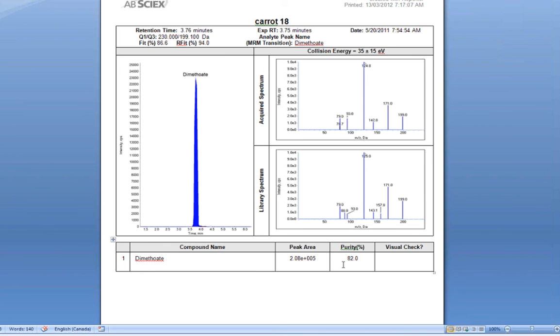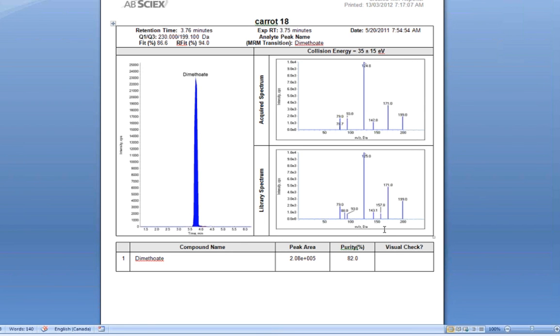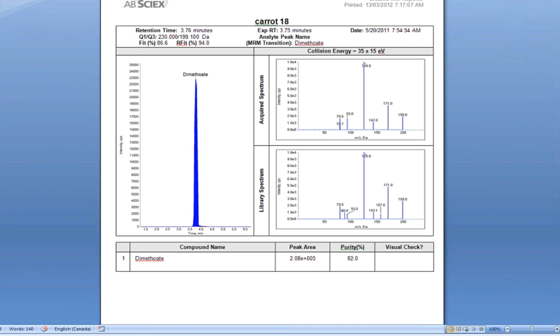Dimethoate returns with a purity score of 82%. I can scroll down and look at the MRM for the peak and the spectra that was collected underneath this MRM transition. The top spectrum shows me the acquired spectrum for the actual sample, and the lower spectrum is the entry in the library. I can visually see that these two spectra resemble each other, and I also have the confirmation of a good fit and reverse fit score for this sample. All of these clues indicate that this carrot sample has tested positive for dimethoate.